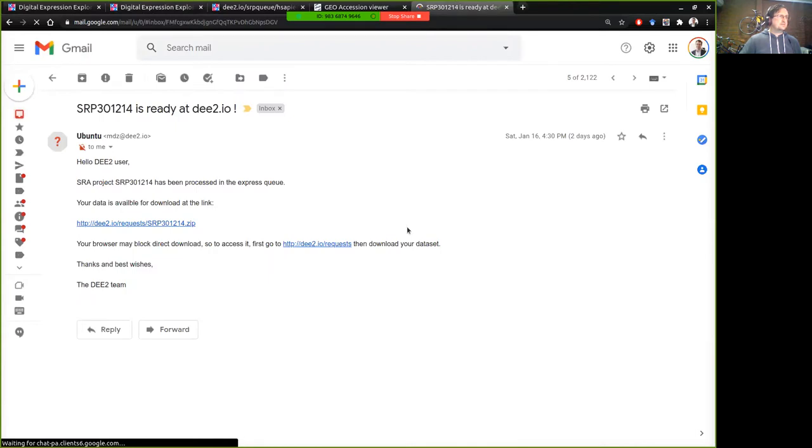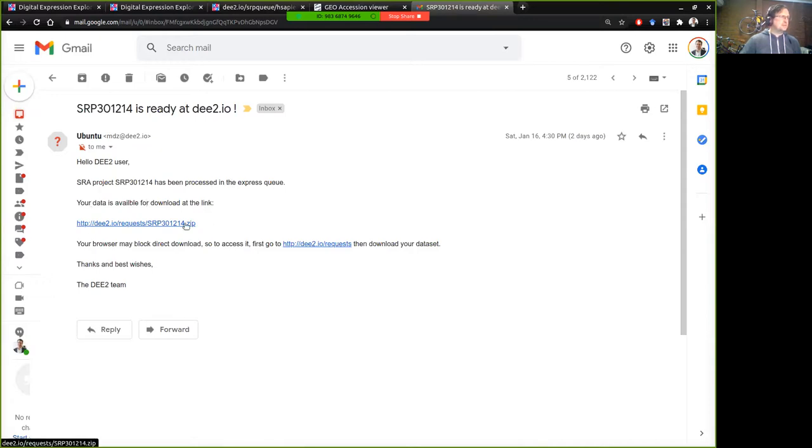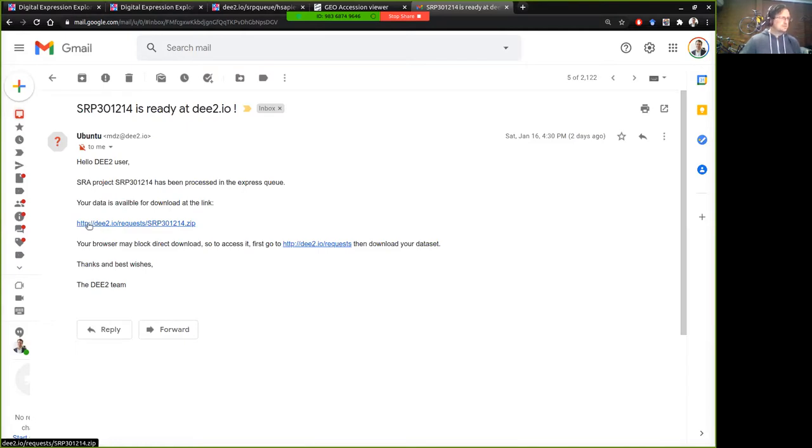So what you'll get is an email notification from Ubuntu at this email address and it will say that a certain SRA project has been processed and the data is available at the link. So there's a direct link to this zip file and that may or may not work because we're dealing with the servers that I have access to on the Nectar cloud that can't be encrypted so I can't have HTTPS so that might get blocked.